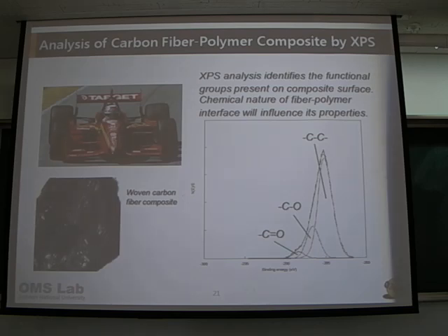So if you take the XPS, you won't get these separated. Overall, it will just look like this one. So you don't know whether this is the C or O or even the SP, the P orbital. So from this XPS, you have to deconvolute, or whatever, to separate this one. Then this is after separation. From this peak you can separate using that program.